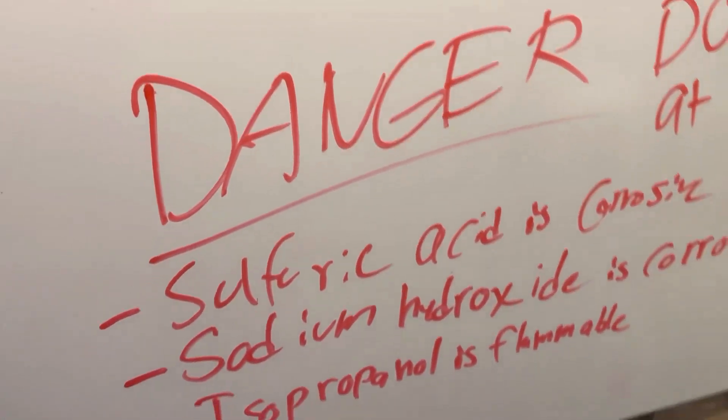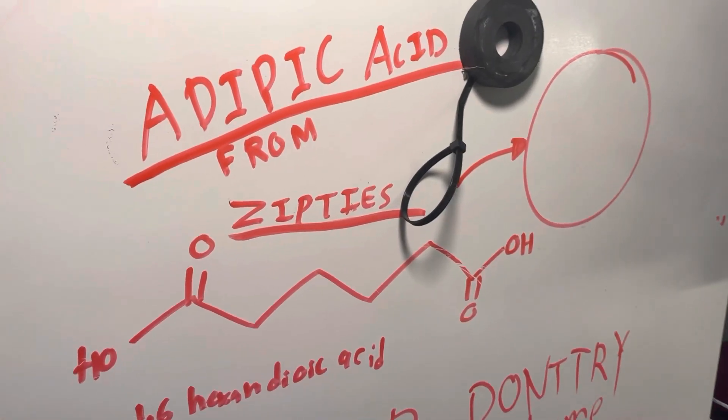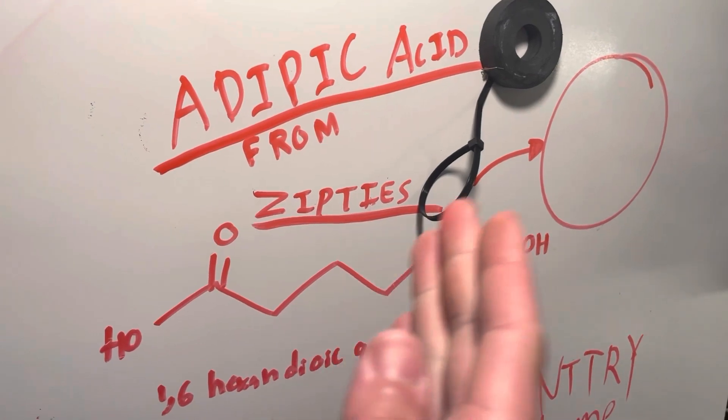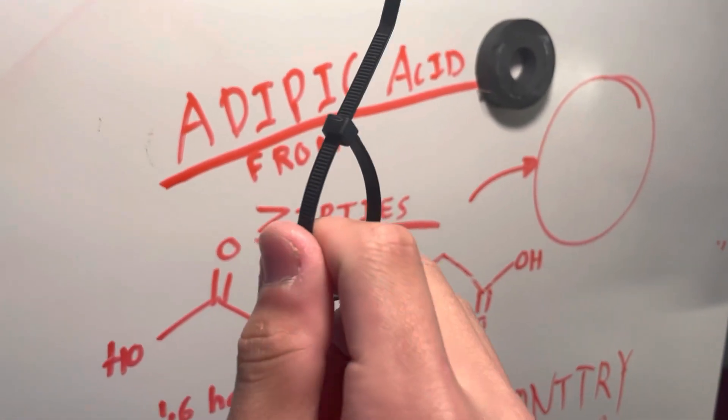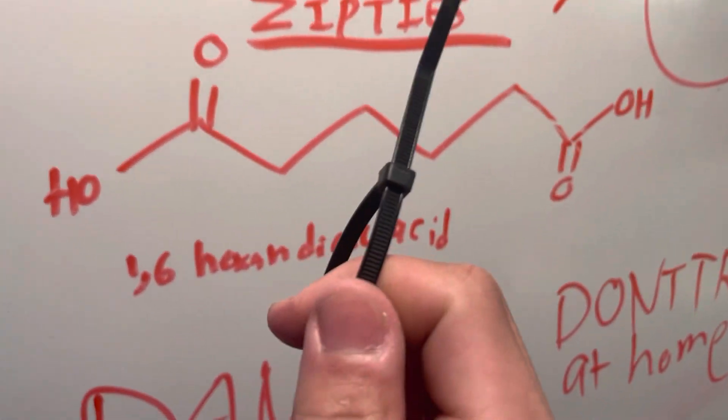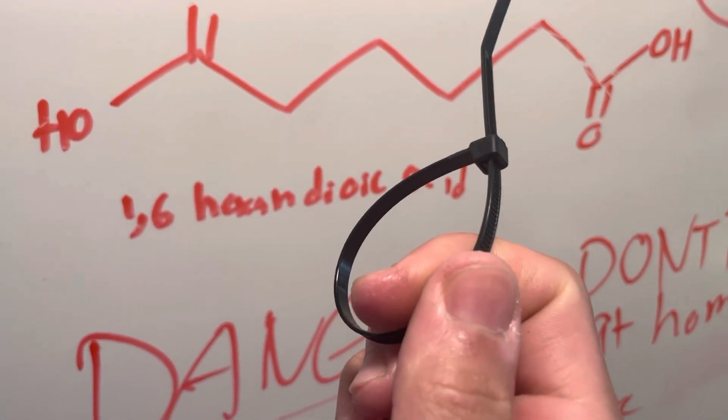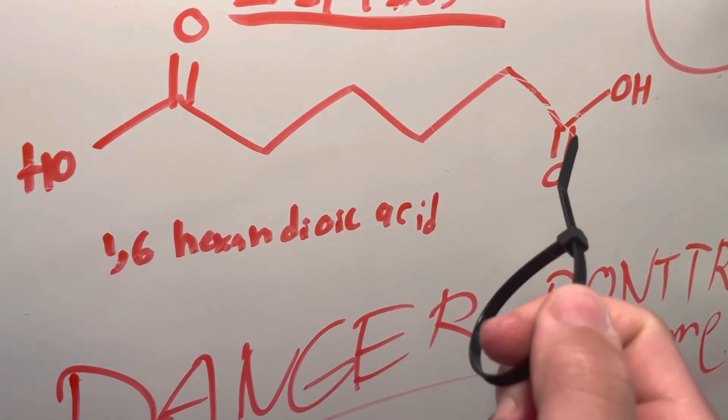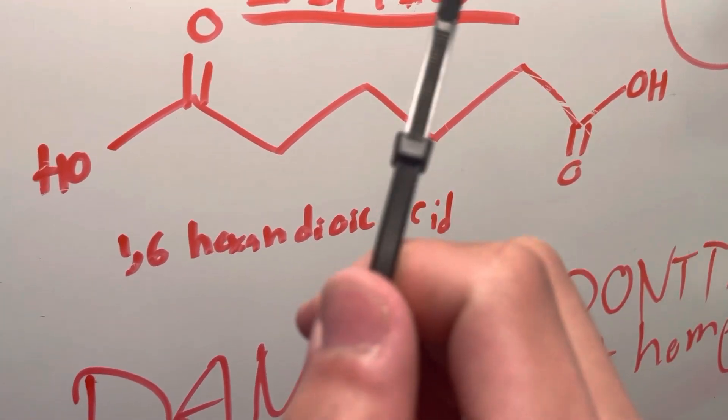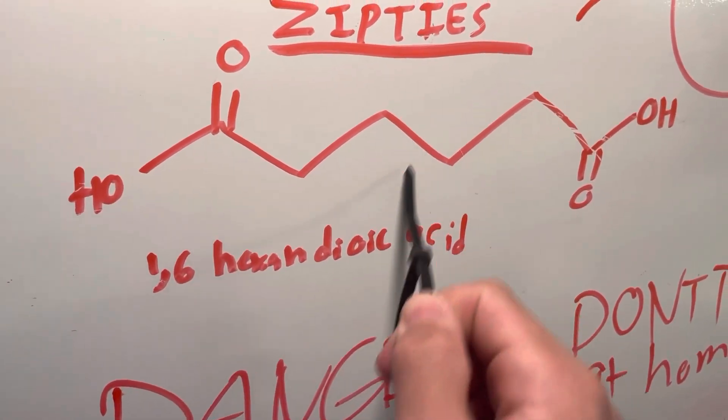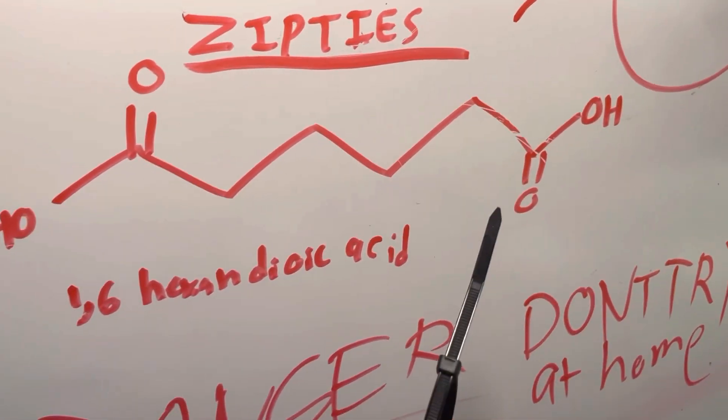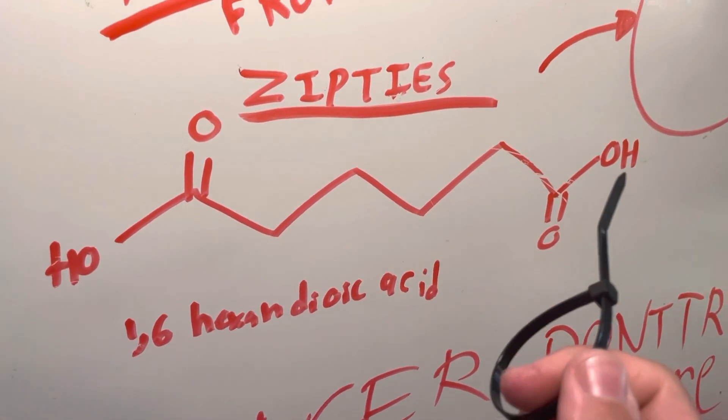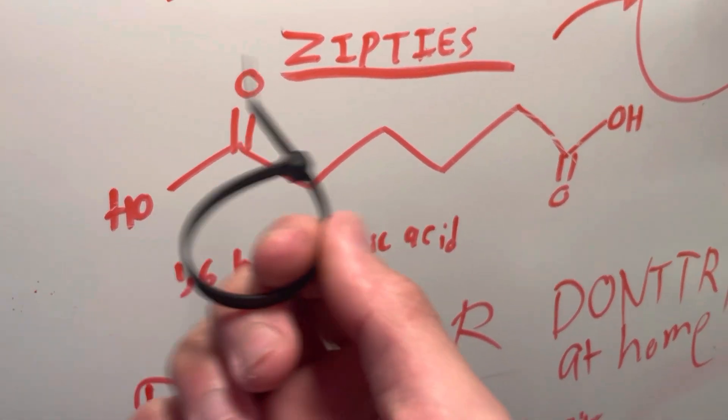Hooray! Hello, tryers! So today we'll be synthesizing adipic acid from zip ties, well, specifically Nylon-6-6, which it's called that because nylons are polyamides.